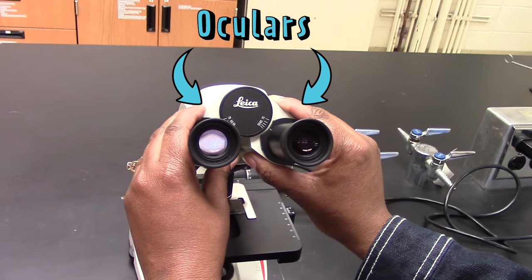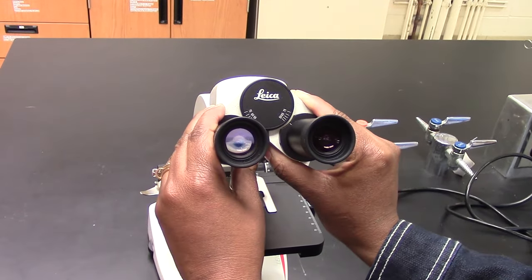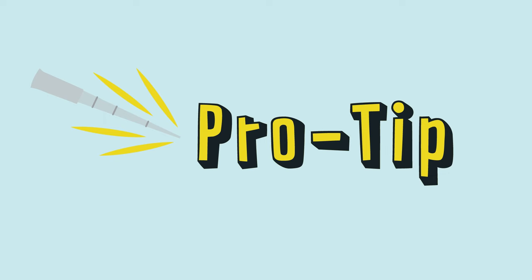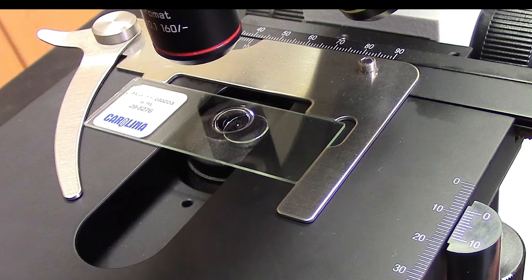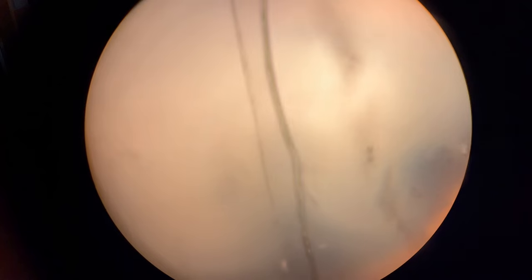If your microscope has two oculars, you should be able to adjust the distance between them so you can see through both at the same time — adjust the oculars so they match your eyes. If you can't find your sample, use the stage knobs to move the slide so the edge of the cover slip is directly under the objective, then focus on the edge of the cover slip.